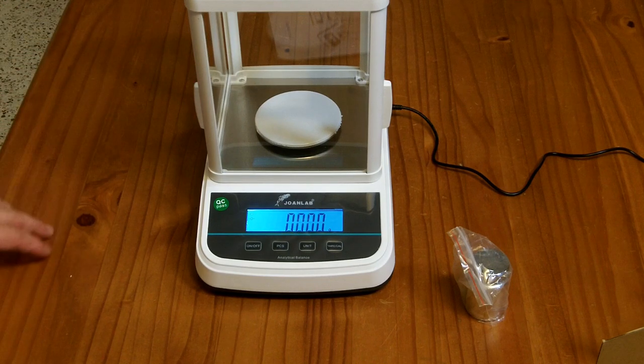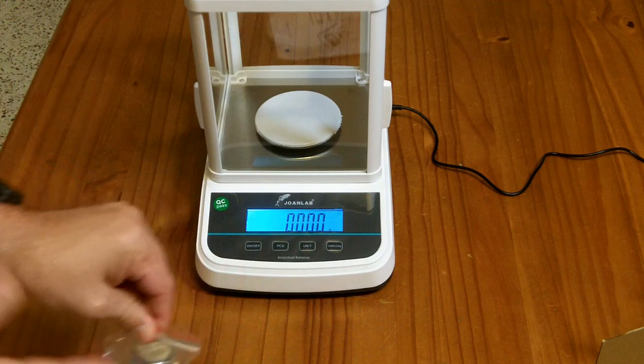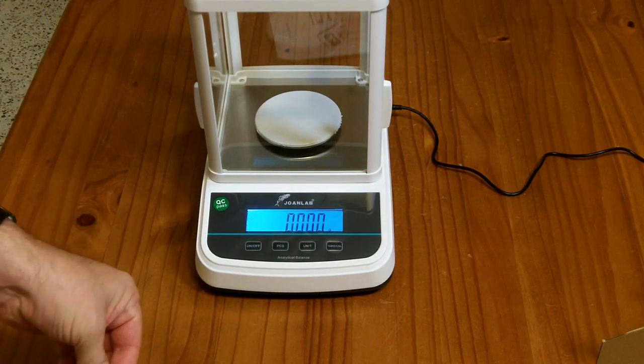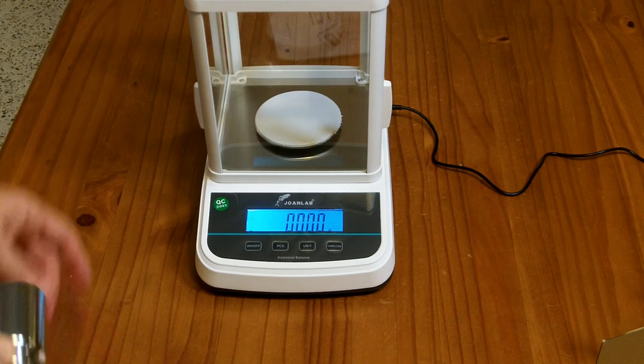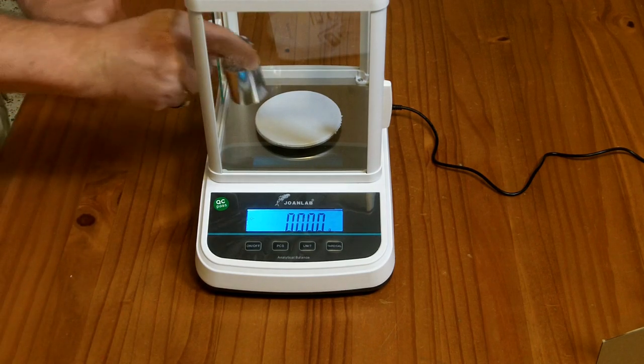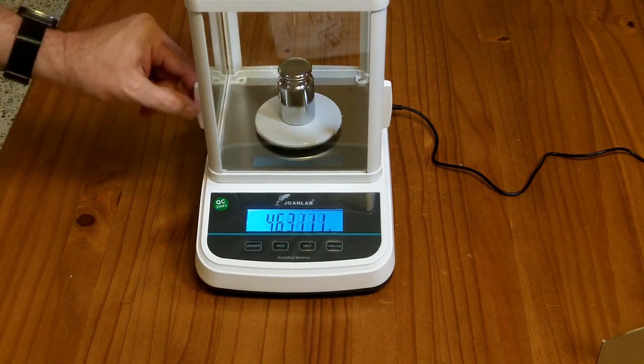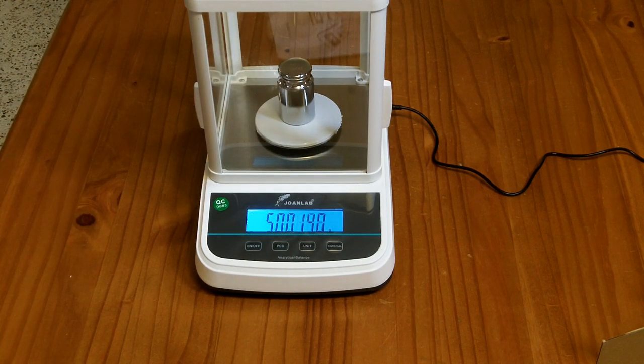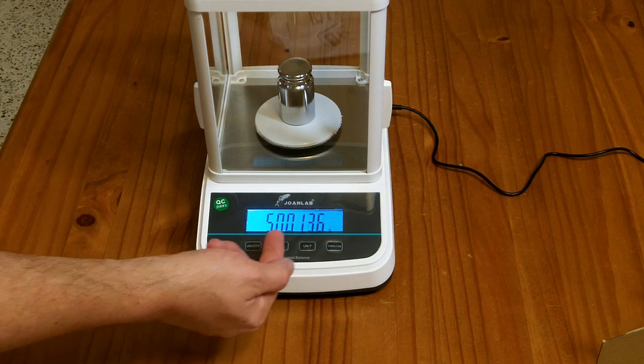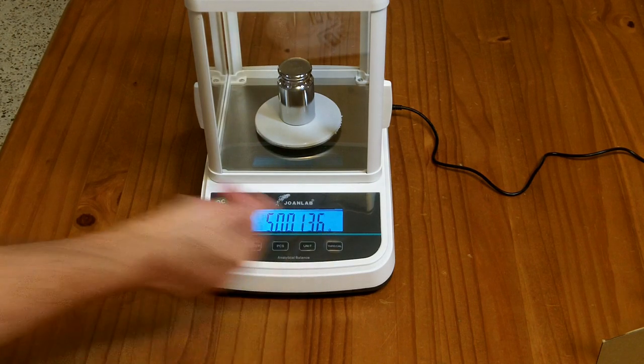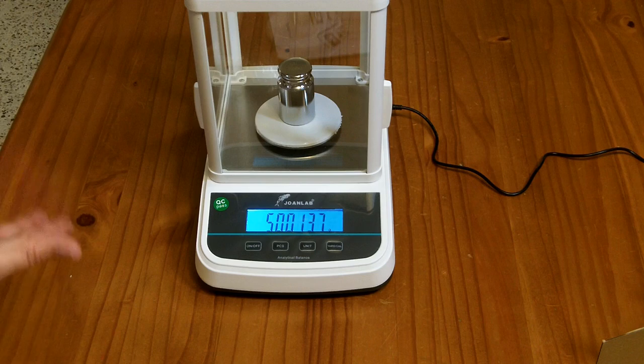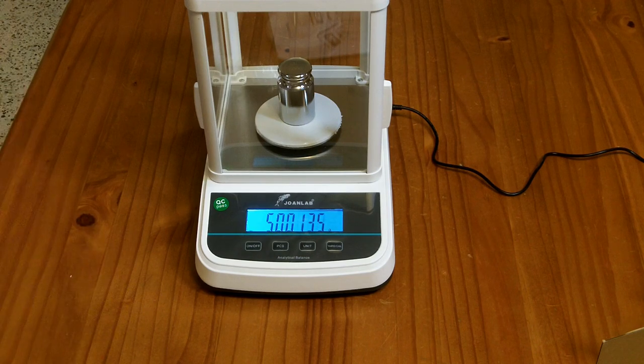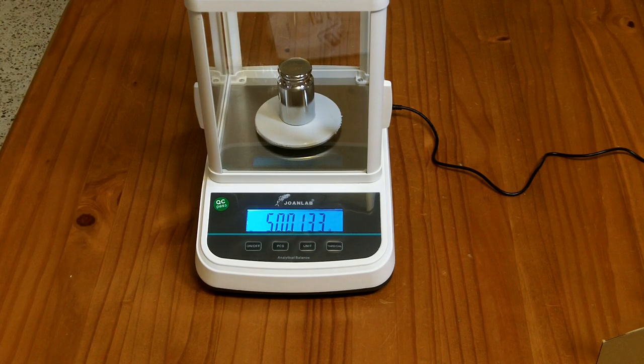So a scale like this with this much accuracy is typically used in chemistry labs or jewelers to measure small amounts of gold for example. Let me go ahead and put this 500 gram weight on that they have thoughtfully provided. So this reads 500.136. So that .136 might be oils from my finger, might be the scale's slightly miscalibrated. So there is a calibration procedure that uses this 500 gram reference weight.